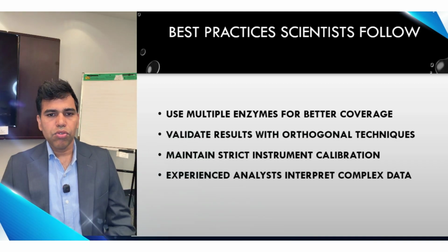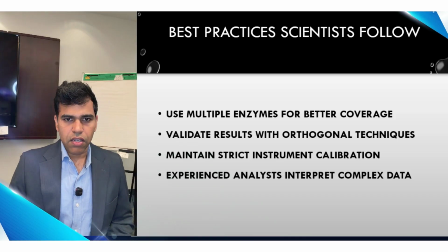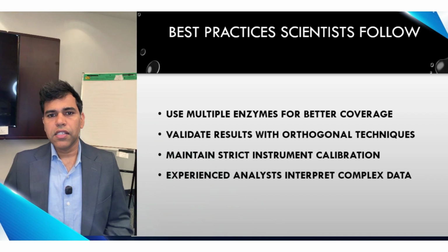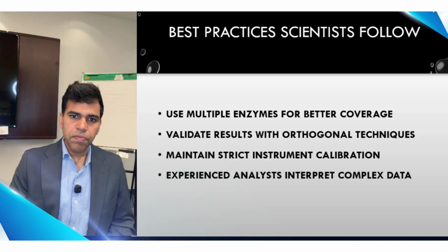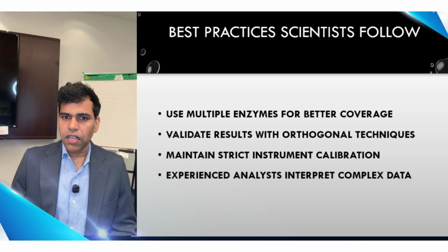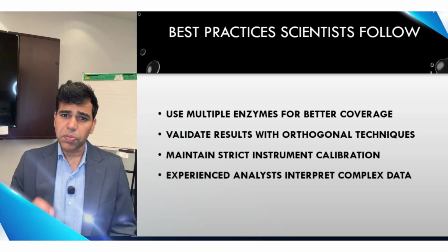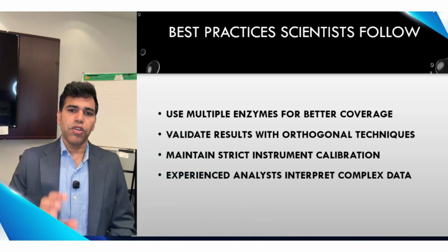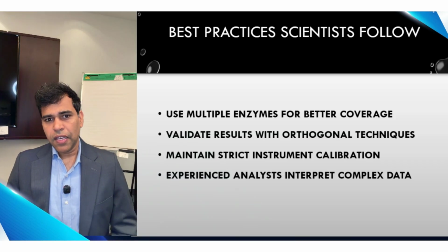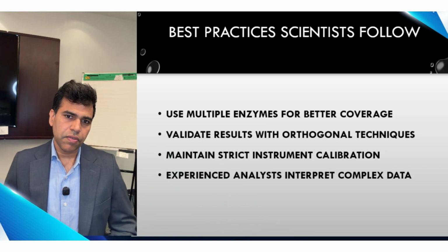Maintain rigorous instrument calibration throughout the run, not only at the start. And ensure that experienced analysts are interpreting the spectra. And the last point is consistently underestimated: a fragmentation spectrum for a structurally modified peptide is not self-interpreting. The analyst's judgment is a functional part of the method.